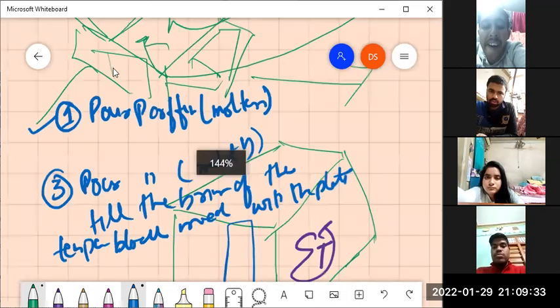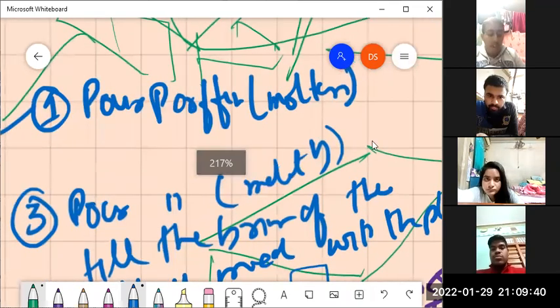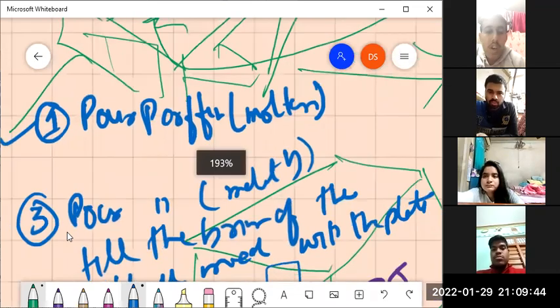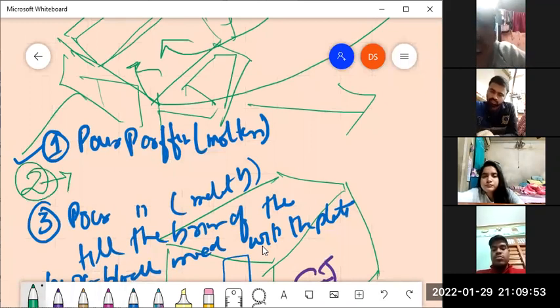Understood? The plates that we were using to create the hollow space, part of the hollow space to be filled up with the molten paraffin. Remaining part would be again filled up with the molten paraffin, but in between this, there now is the second step. In this step, what are we doing?